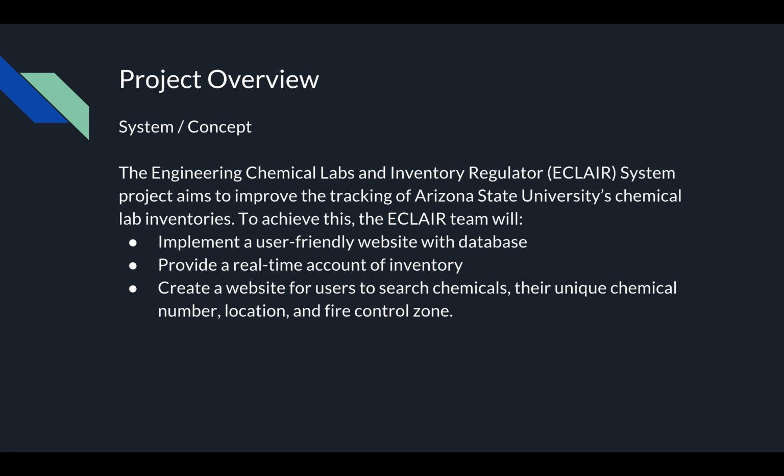So looking at the project overview, we have the system and concept as being for the ECLAIR. The aims of this project are to improve the tracking of ASU's chemical lab inventories. To achieve this, we want the ECLAIR team to implement a user-friendly website with database functionality. We also want to provide a real-time account of inventory. That way, a user of this program can check in real time what the inventory is like, how many chemicals are being stored in what location, etc.